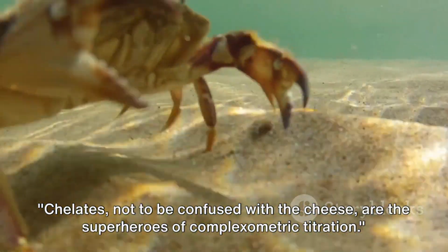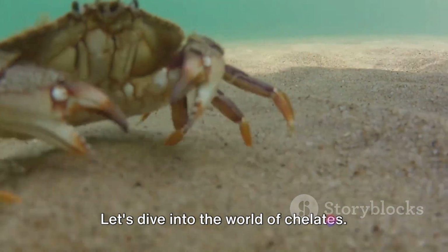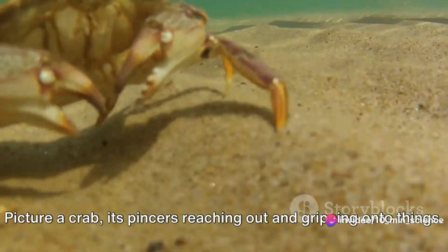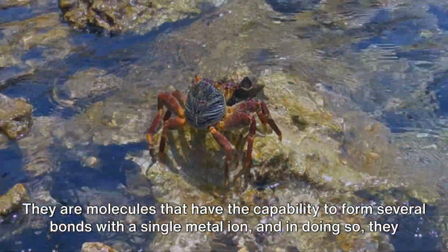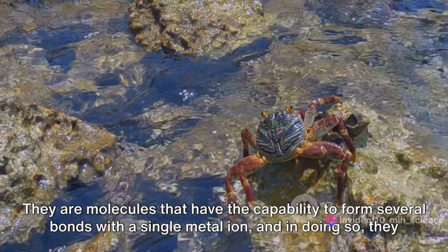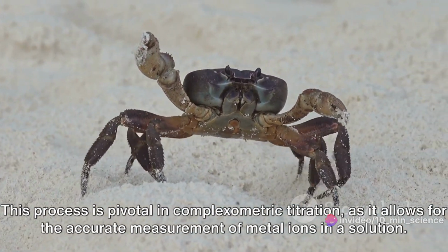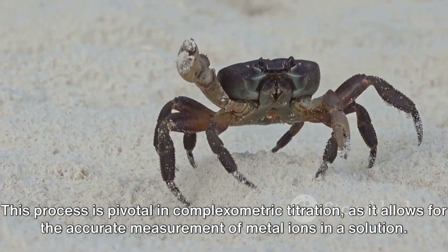Chelates, not to be confused with the cheese, are the superheroes of complexometric titration. Let's dive into the world of chelates. Picture a crab, its pincers reaching out and gripping onto things. This is essentially what chelates do on a microscopic level. They are molecules that have the capability to form several bonds with a single metal ion, and in doing so, they grip onto the metal, creating a stable structure. This process is pivotal in complexometric titration as it allows for the accurate measurement of metal ions in a solution.